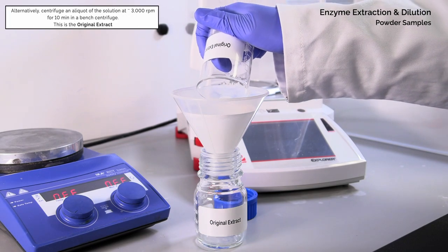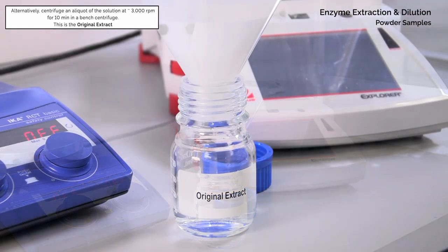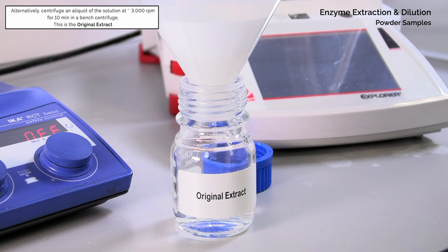Alternatively, centrifuge an aliquot of the solution at approximately 3000 rpm for 10 minutes in a bench centrifuge. This is termed the original extract.